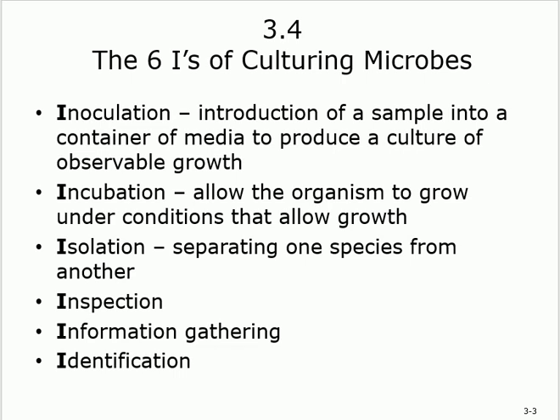Incubation, on the other hand, is when you incubate something, like we say that the baby is premature and we put it in the incubator, right? What's an incubator? It's something, a medium that contains everything needed for that baby, right? Same thing here. You put it in a medium that contains everything, including the temperature, including the amount of air, oxygen, everything. And we'll go through that.